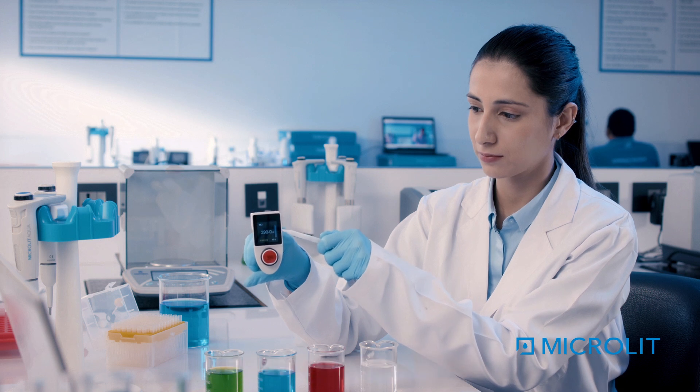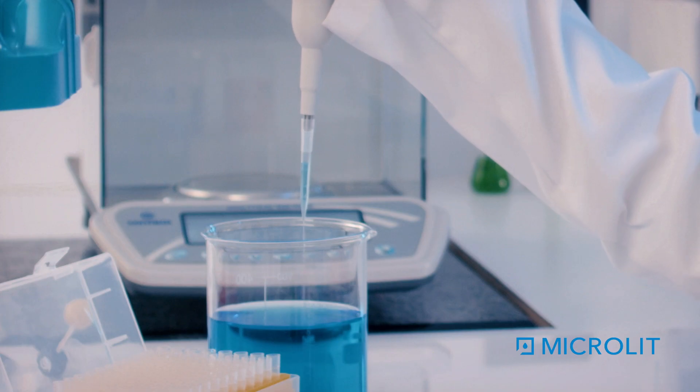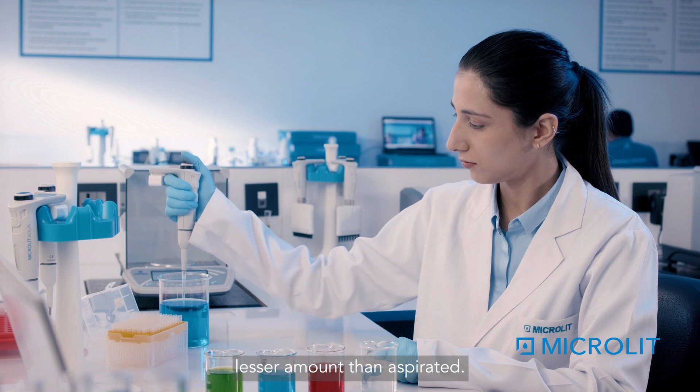Press the plunger button to aspirate the liquid. Once the liquid is aspirated, the display will show the dispense indicator. Press the plunger button again to dispense the liquid. One can also dispense a lesser amount than aspirated.